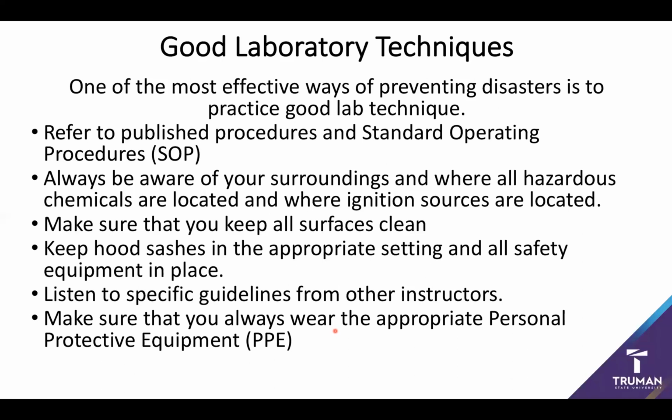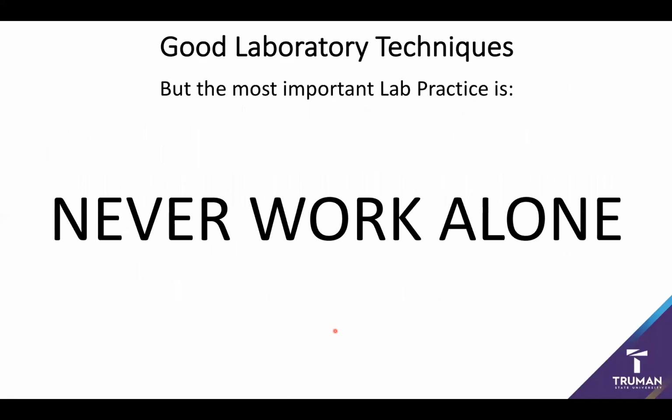But I do want to emphasize what perhaps the single most important lab practice you'll ever encounter is. And that's you never, ever, ever work alone, because Murphy's Law says that things will go wrong, and they'll go wrong when you least expect it.